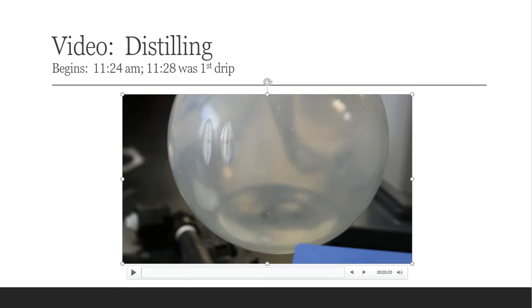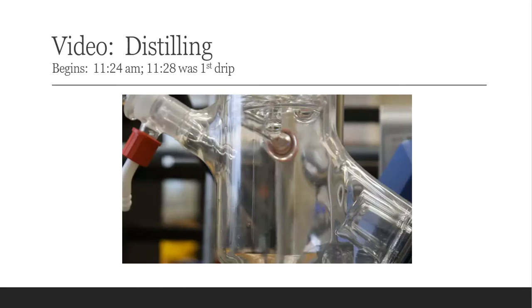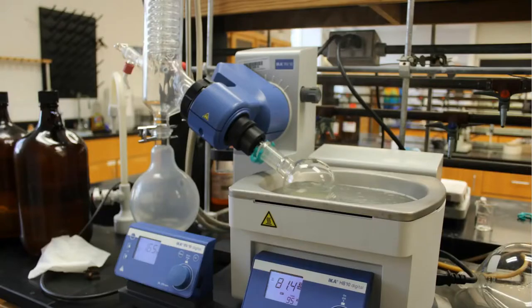Okay, so that's all the video is going to show you. Again, very simple. Some of the stuff that we've done over and over throughout the course so far. Here's just another image, maybe a different point of view for the rotovap. You can see my Florence flask in the hot water bath here. That hot water bath right now is at 81.4. It still hasn't reached 95, but my petroleum ether is coming off, and that's really what I want to see.